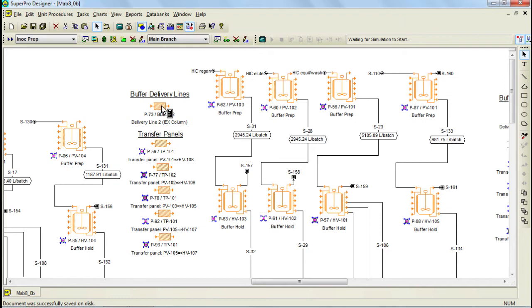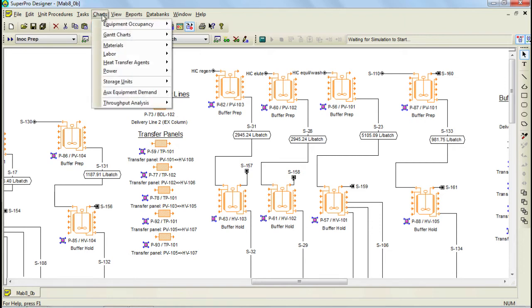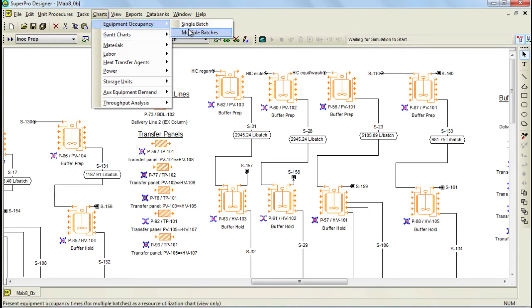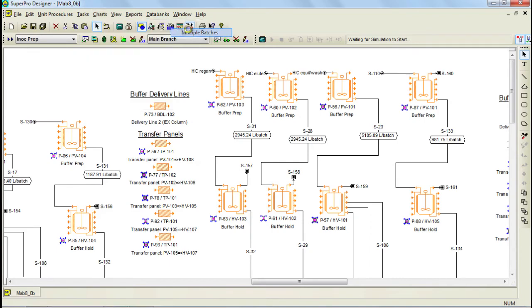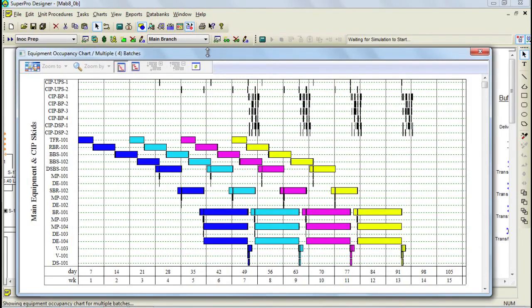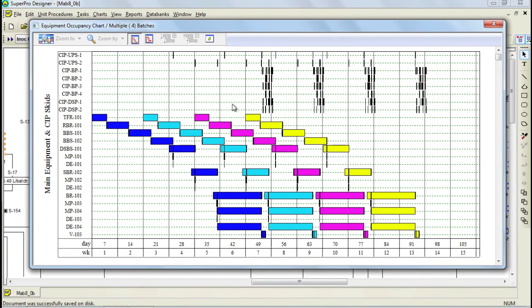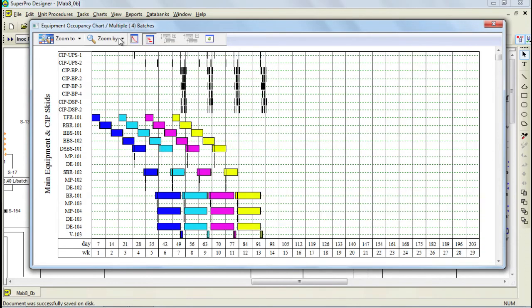SuperPro Designer is equipped with a number of features to view the outputs once you have built the model and solved the mass and energy balances. Among these features, there are several charts which help you view and interpret the outputs and they can be generated through the charts menu. Here you see a list of different charts that you can generate. The Equipment Occupancy chart, for example, displays the Equipment Occupancy as a function of time. Let's zoom into the chart to have a closer look.